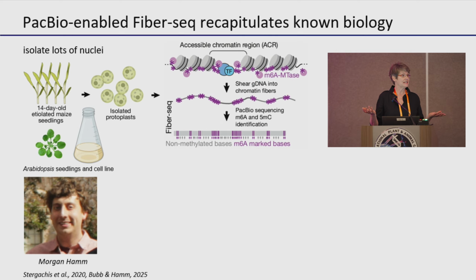People often ask me, how hard is it? If you can do ATAC-seq, you can do Fiber-seq, okay? It's easy.